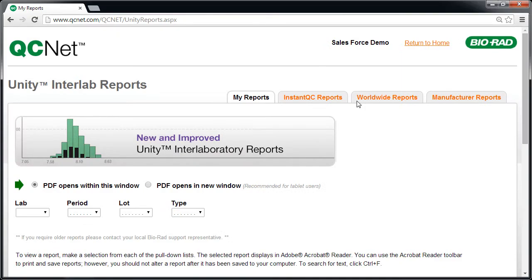Biorad is constantly improving QCNet, so you may notice improvements to this page.